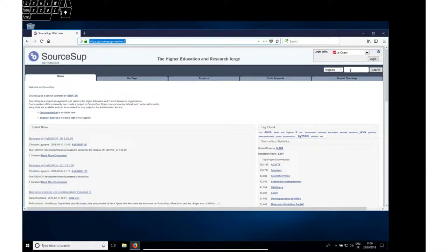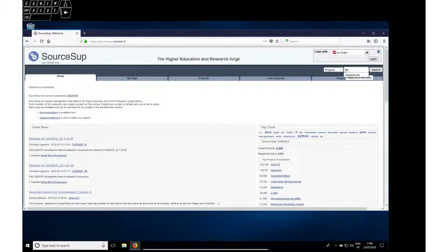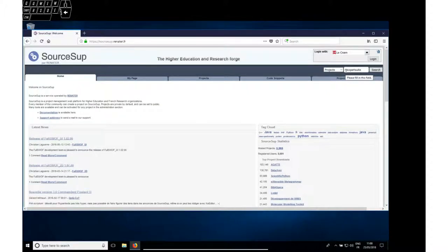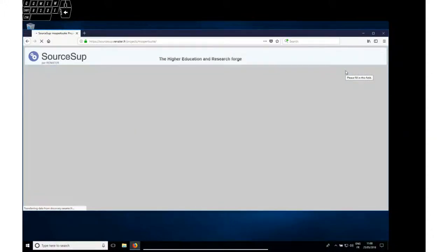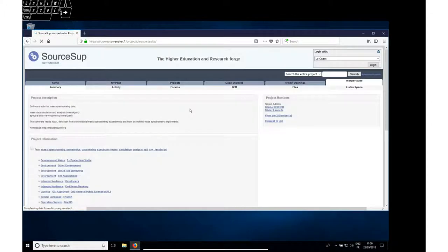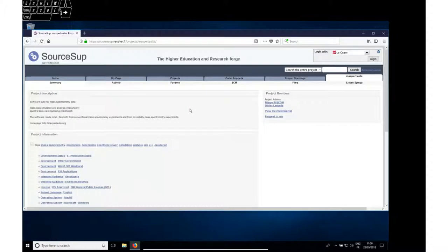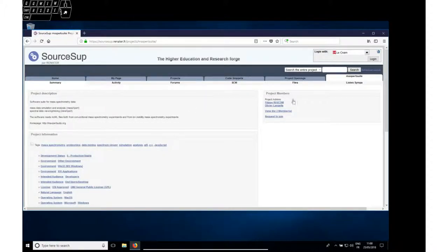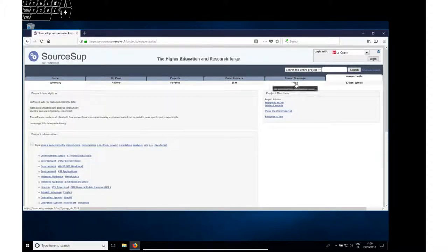If you reach that page, you can insert MS Expert Suite in the search toolbar. Once you get to the MS Expert Suite page, just ask for the files tab.